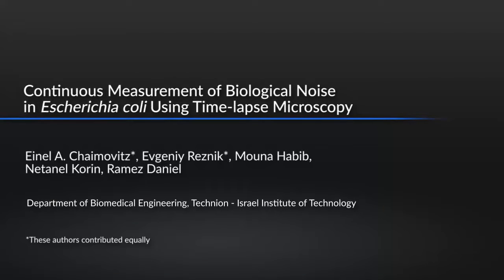This protocol enables continuous measurement of genetic circuits in E. coli and the calculation of the signal variability and signal-to-noise ratio in individual bacterial cells to assess circuit performance. The main advantages of this technique are that it is easily adaptable to different strains and labs, requires minimal training and no special equipment, and is relatively inexpensive.